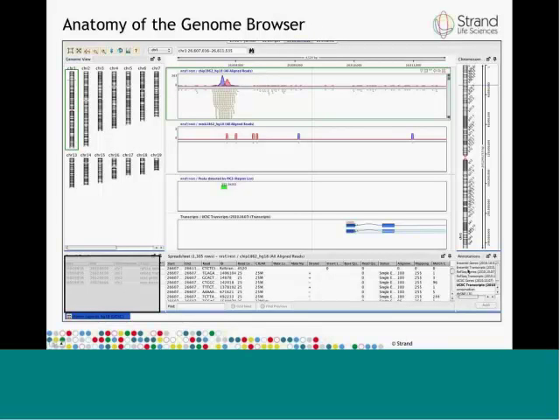At the bottom right corner, you can see the annotations corresponding to the appropriate build of the organism of interest. These annotations can again be visualized in the region view by double-clicking a particular annotation, or single-clicking an annotation and clicking on the Add button at the bottom.